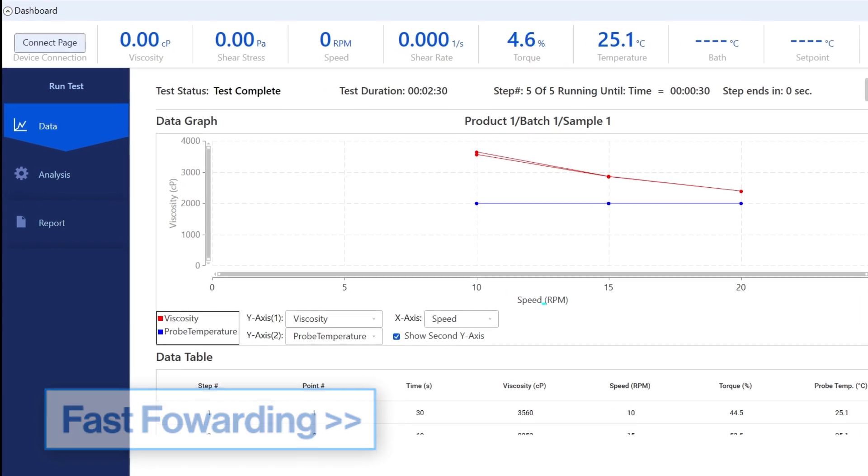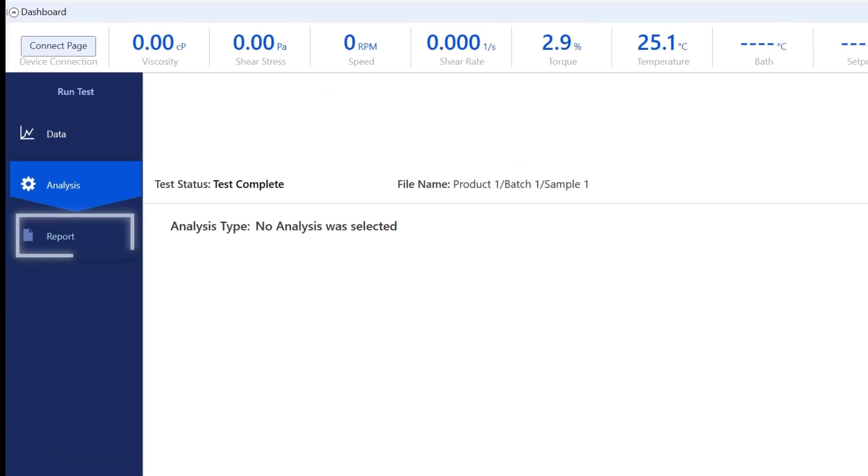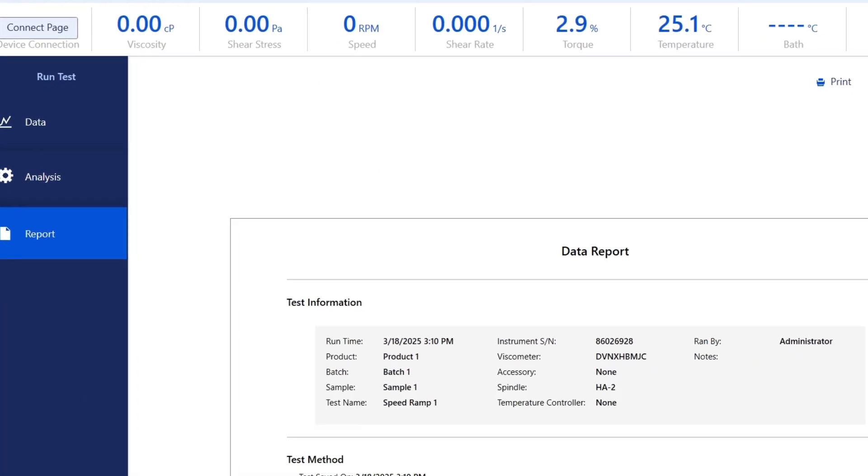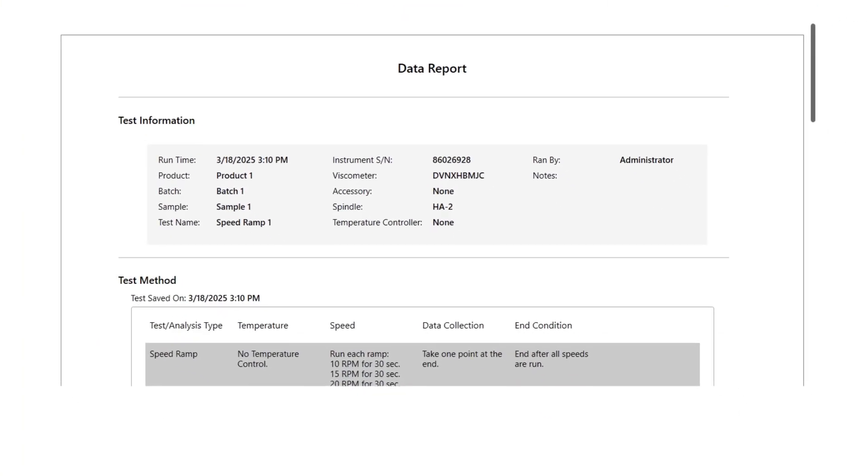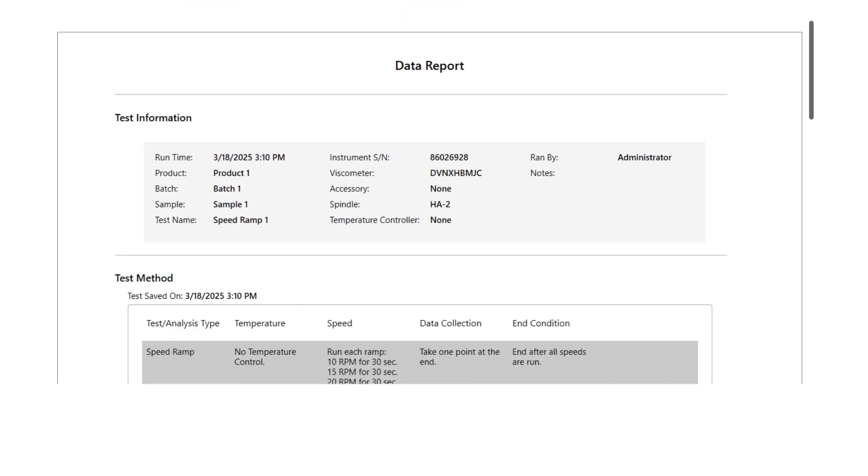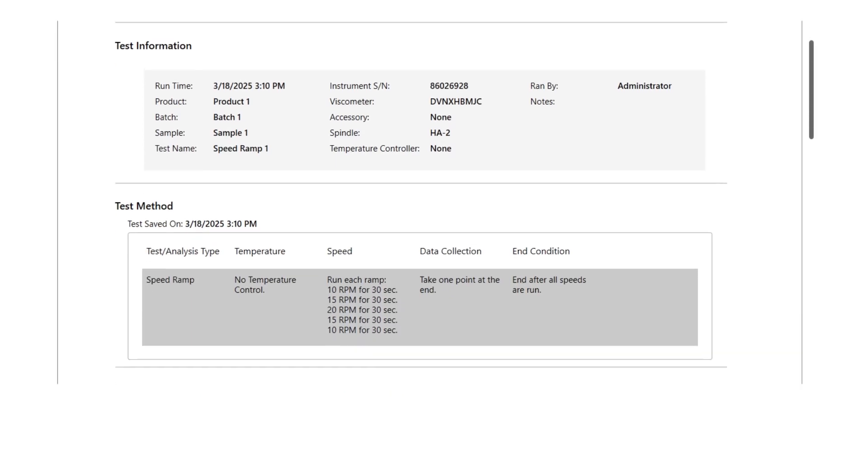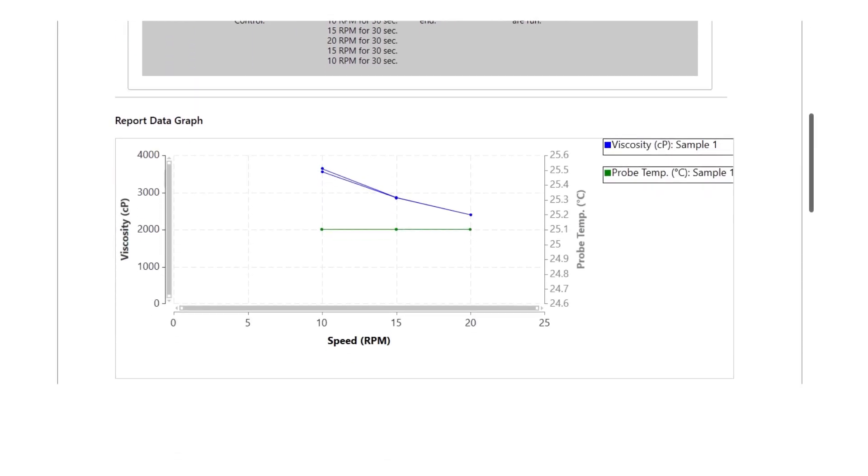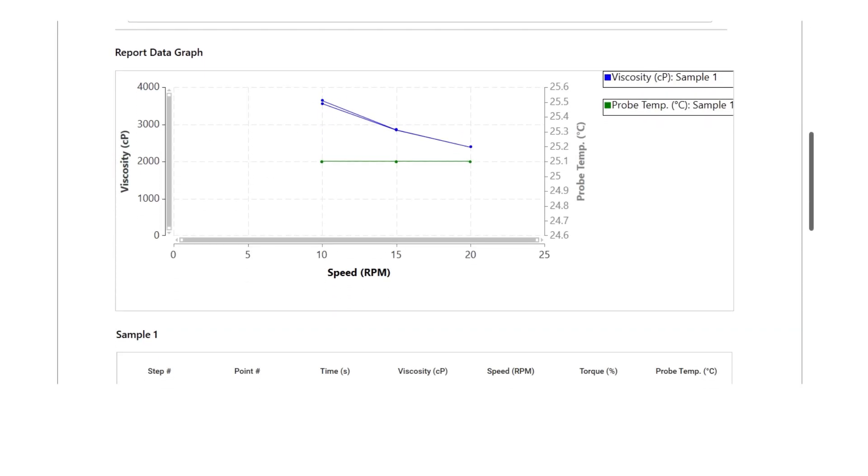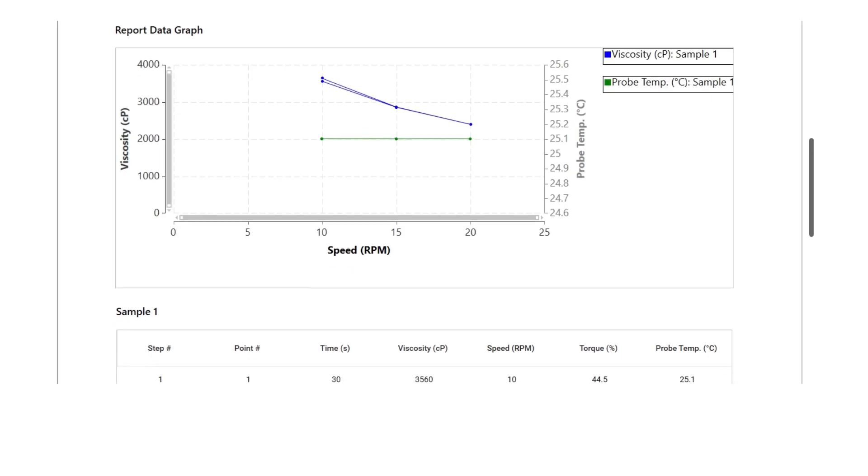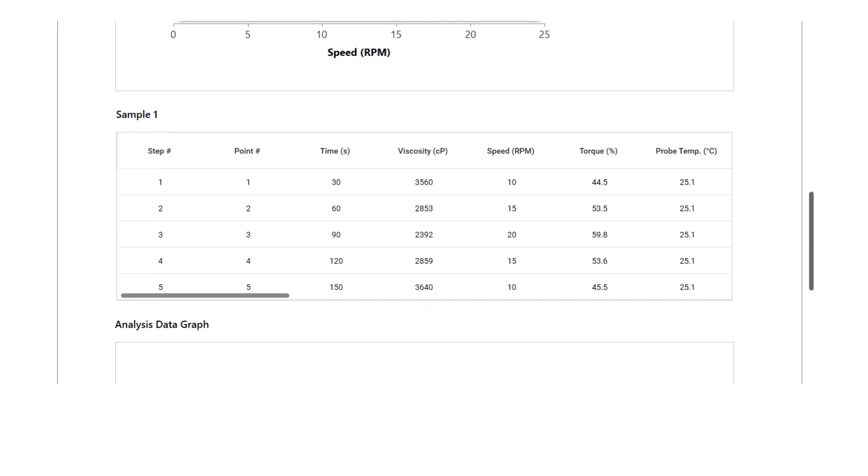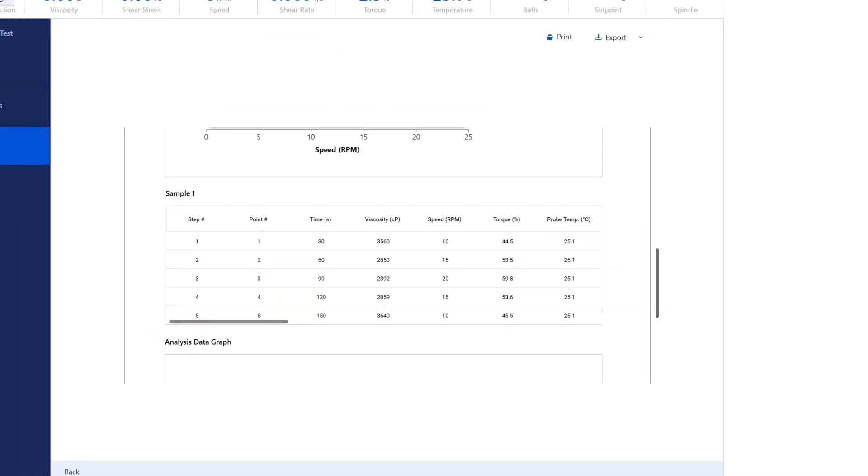Once the test is over, we can navigate to the report section to look at the data. Reviewing the data, we see that this is a shear thinning material as the viscosity decreases as we increase the speed. It's also a purely viscous material as the viscosities are comparable on both the ramp up and down portions.